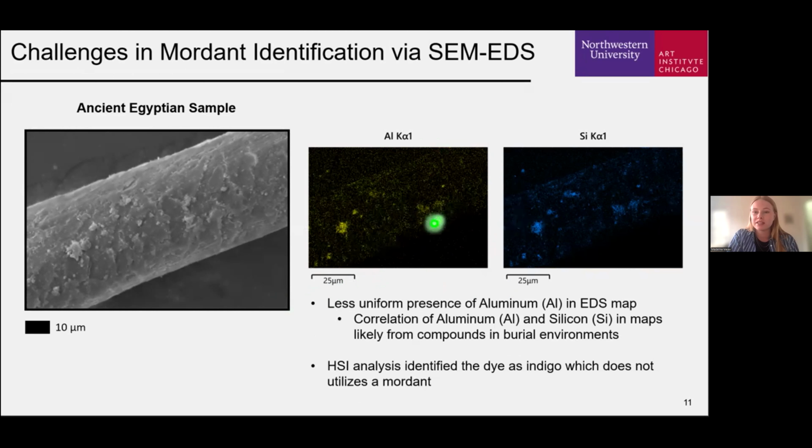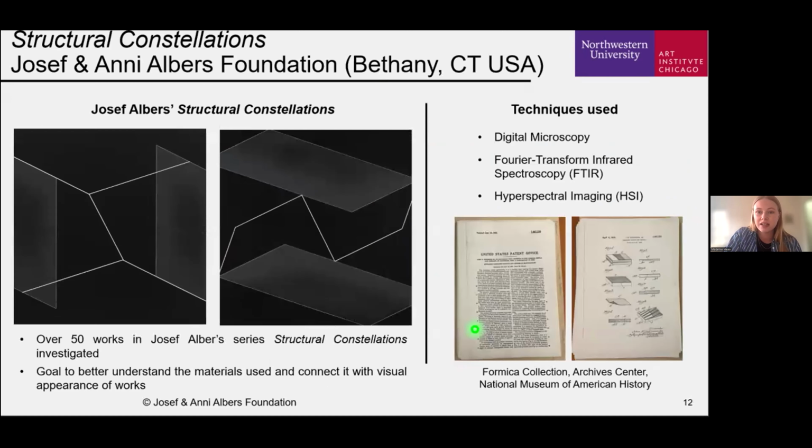In contrast, additional EDS mapping of another Egyptian sample had less uniform aluminum distribution, but was still present across the entire fiber. However, when these aluminum maps were compared to those of silicon, the areas of intensity were in the same region and thus attributed to soil or burial debris on the sample surface, further validated by the identification of indigo via hyperspectral analysis, which does not use a mordant.